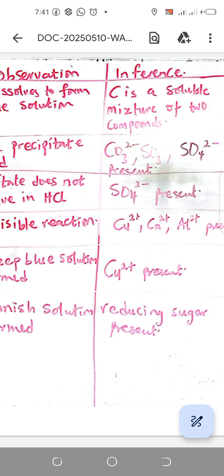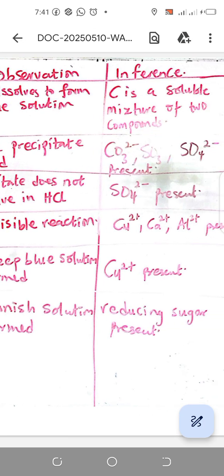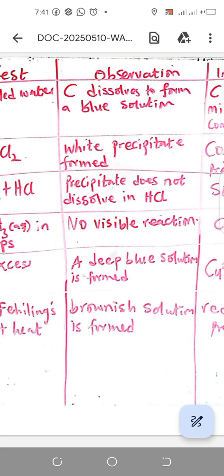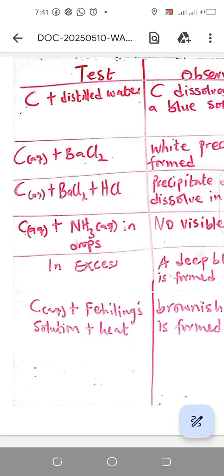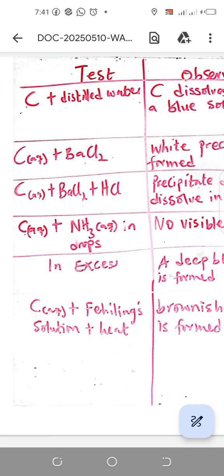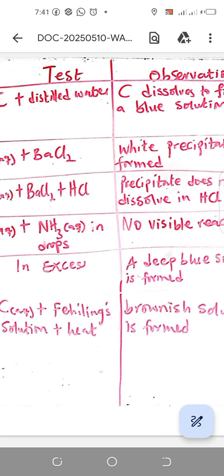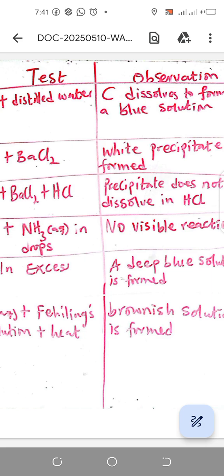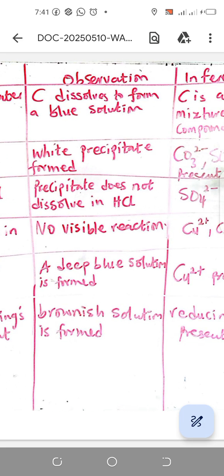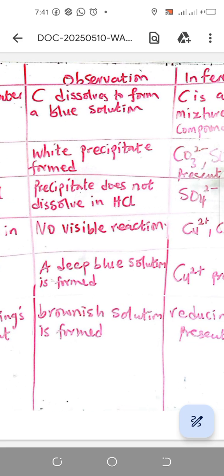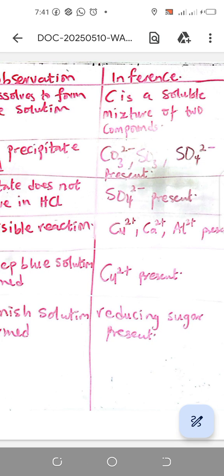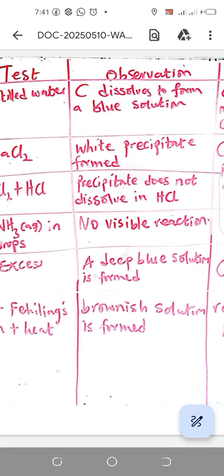Take note, the salt is a mixture of two salts, the mixture of two compounds—one an inorganic salt and one is an organic compound.